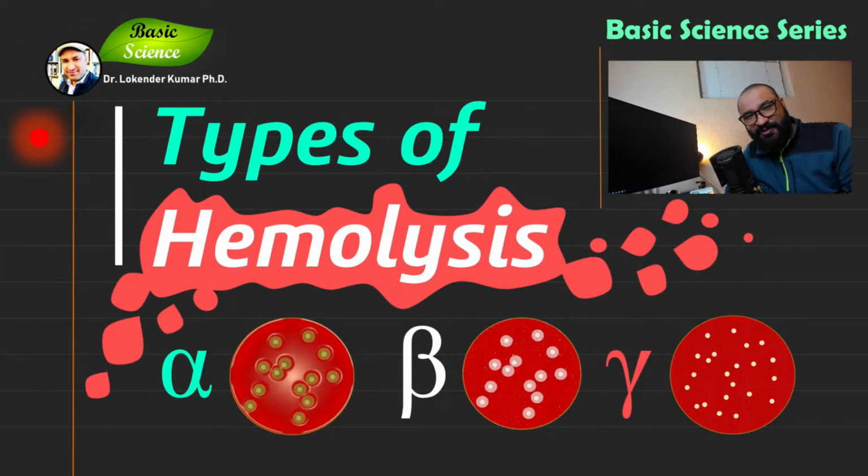I'm your host Lokendra Kumar, and today we will discuss types of hemolysis, which is alpha, beta and gamma hemolysis. If you have seen my previous video, I have discussed how to prepare blood agar. In this video, I will discuss how to inoculate the blood agar and how to detect the hemolysis on the blood agar and what are the distinct features of alpha, beta and gamma hemolysis.